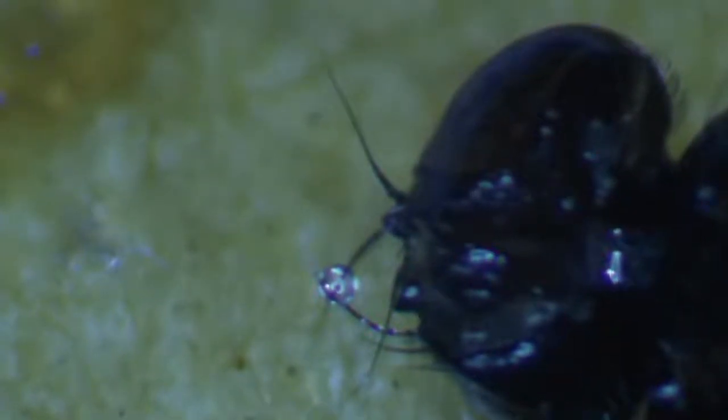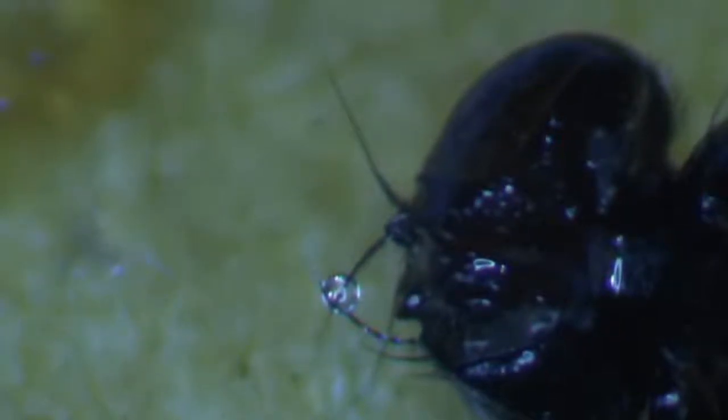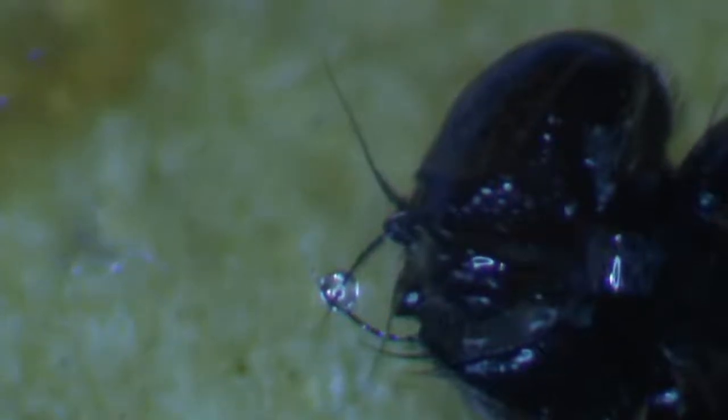Tinny coming out of the head. Eyes are still really wet. They're not dry, clear facets you could see from the other day. So I could actually decompose quite a bit more.